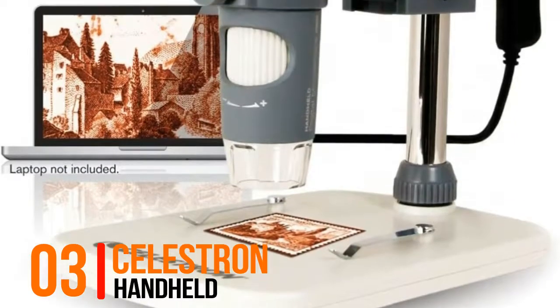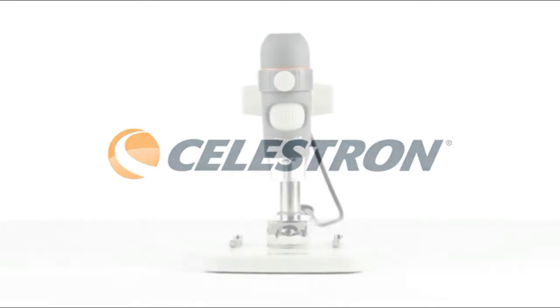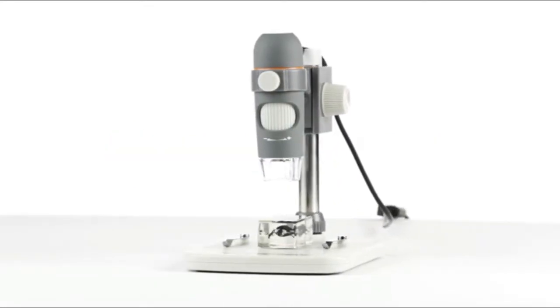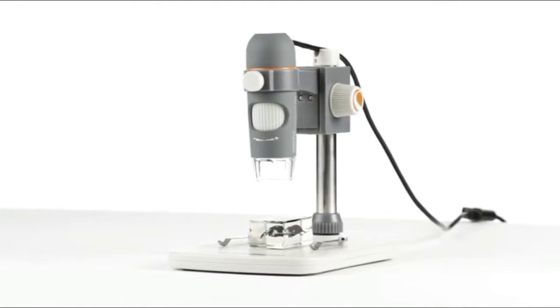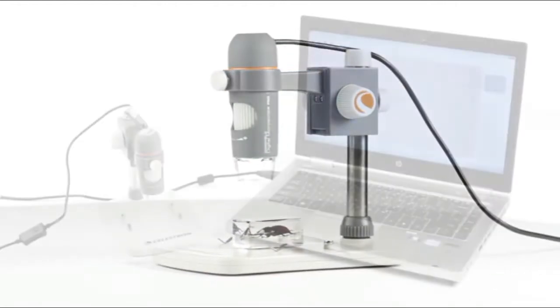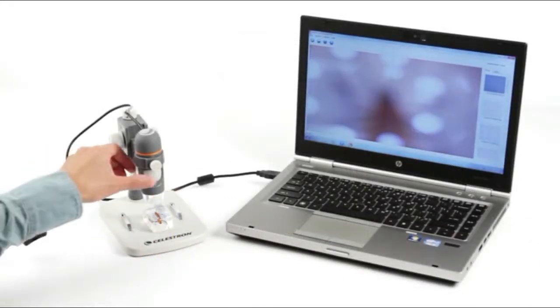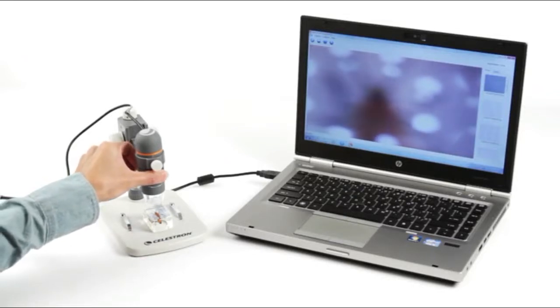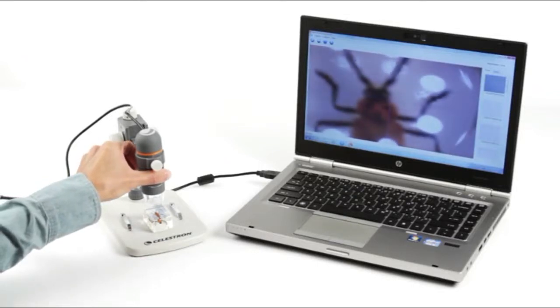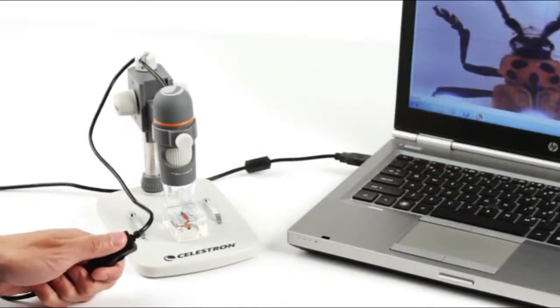Number three, Celestron handheld. Get Celestron's best viewing experience for your 3D specimens with the 5 megapixel USB powered handheld digital microscope Pro. With this microscope's precision 5 element infrared reducing glass lens and true 5 megapixel imaging sensor, specimens like minerals, insects, stamps, circuit boards and more come into sharp focus on your laptop or desktop computer.